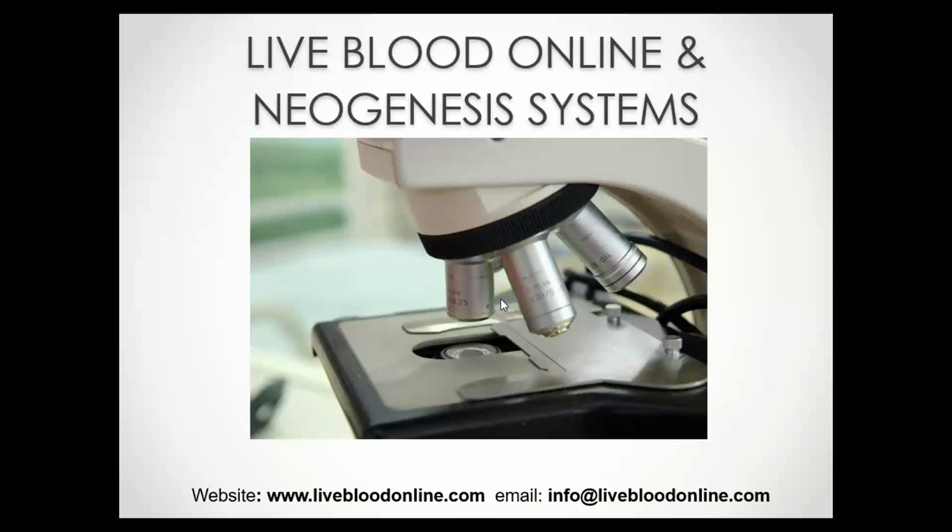Well, in live blood analysis, although it's called blood analysis, we're actually more involved with analyzing the state of the biological terrain. So we can see factors that influence the biological terrain or the health, the balance of the biological terrain quite clearly.